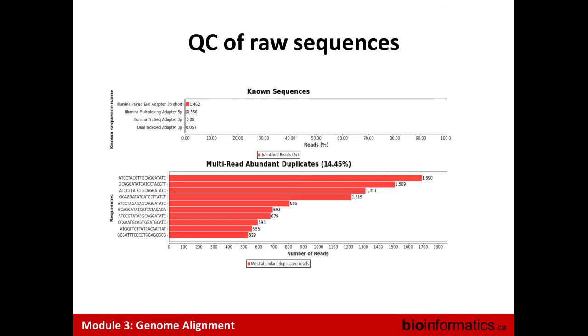So you know how many reads are duplicates. Duplicates is how many times you've got a copy of the same initial fragment in your library. The best is to have almost no duplicates. You want every DNA fragment you put in your library to generate one single read. You don't want 10 reads that represent the same initial fragment, because that means you just overcount the same biological fragment. So it's a good metric. The less you have, the better it is.